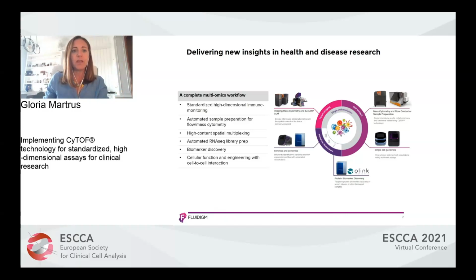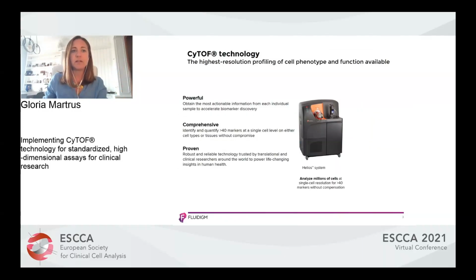Nonetheless, today, what we're going to do is focus on Cytometry technology.